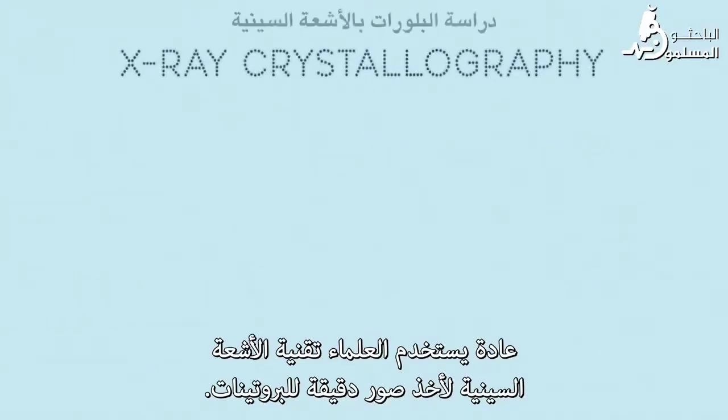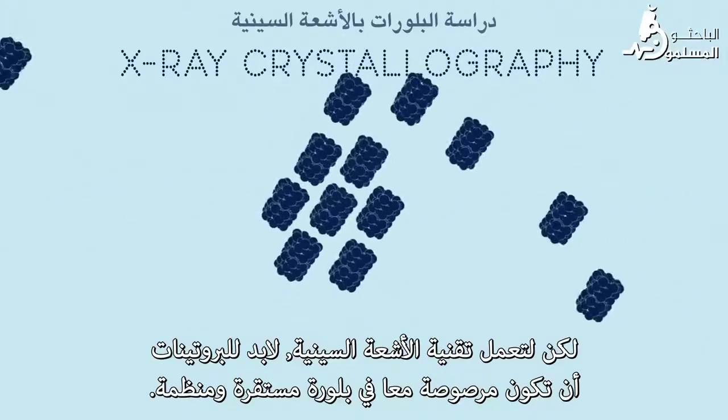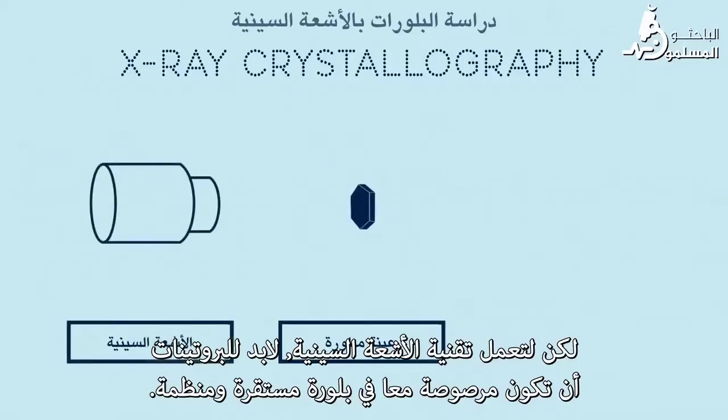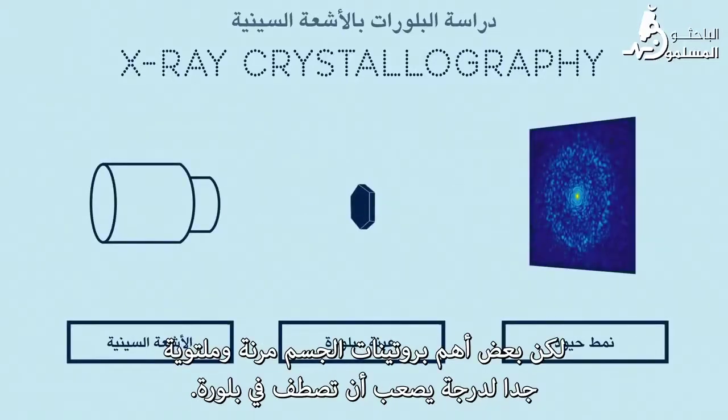Traditionally, scientists use a technique called X-ray crystallography to take pictures of the tiny proteins. For the X-ray imaging to work, it requires proteins to be packed together into a stable, organized crystal. X-rays pass through the sample to create an image, but some of the body's most important proteins are too floppy or wiggly to line up into a crystal.